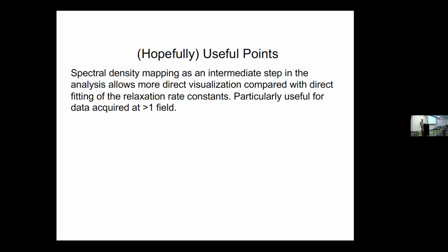For the methyl relaxation, using the approaches developed from Lewis Kay's lab, you're actually measuring deuterium relaxation in either CDH2 methyl groups or CD2H methyl groups. There, the number of spectral densities is relatively small.